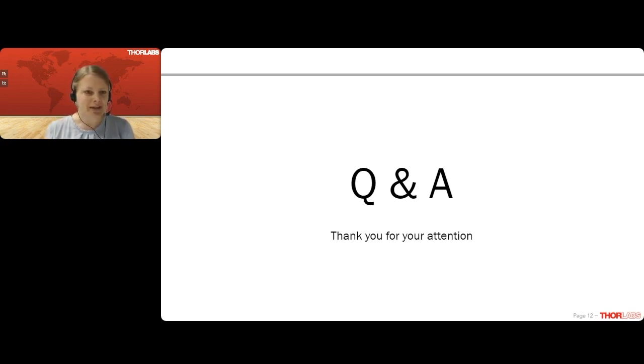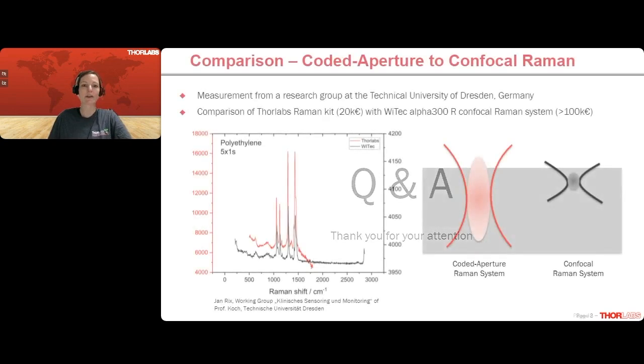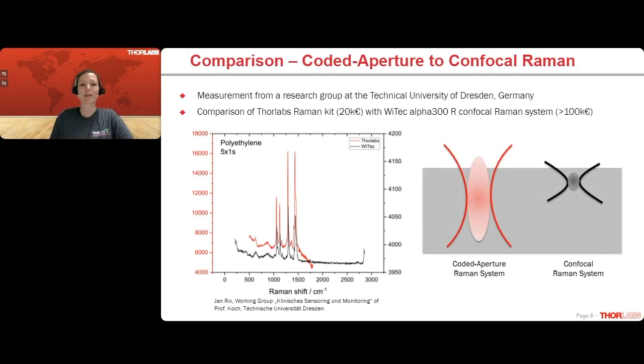Okay. Next question. Is your system suited for integration into a microscope? That's a good question that we already got when we released the Raman kit in 2021. You have to remember, probably I can go back to the comparison slide, because that should make it more clear if we have a look at it.